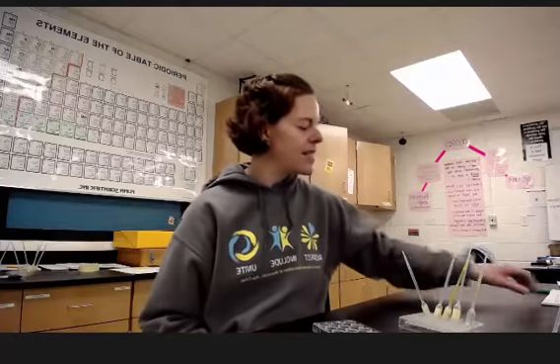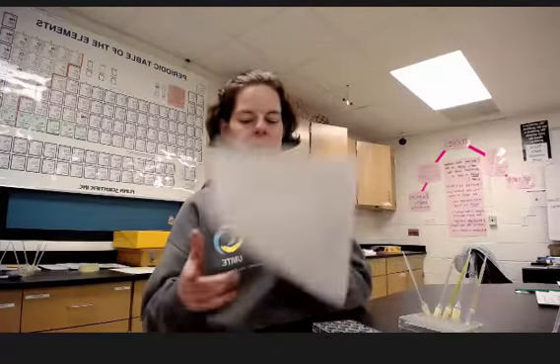Hey team! So today I want to talk to you about how you're going to do the reaction of ions lab. So you're going to be looking for precipitates in this lab. And a precipitate is a solid that gets formed by the reaction of two ionic solutions.